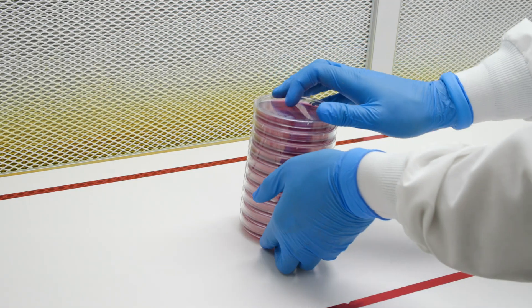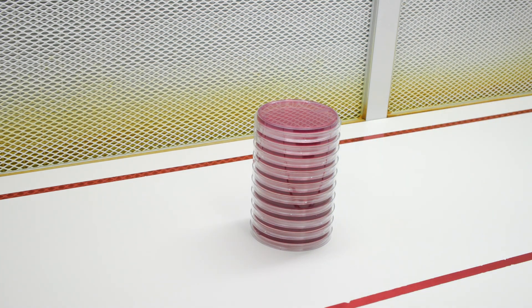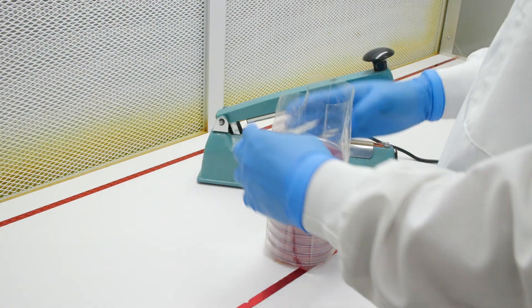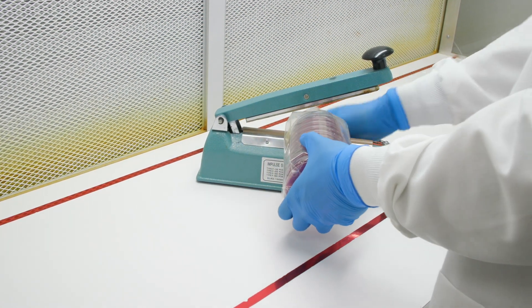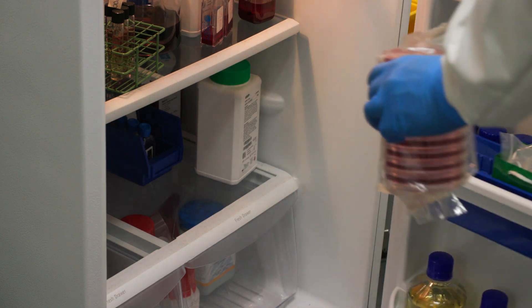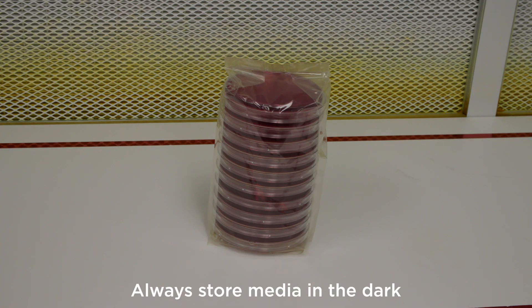If the plates will not be used immediately, store the plates upside down to avoid moisture from condensing on the agar surface — in this way, if there is condensation, it will form on the lid. Keep plates in a plastic bag until you are ready to use them to prevent moisture loss. Store the plates in the refrigerator at 2 to 8 degrees Celsius. Never freeze the media. The plates must be stored in the dark, since light can be damaging to the ingredients.